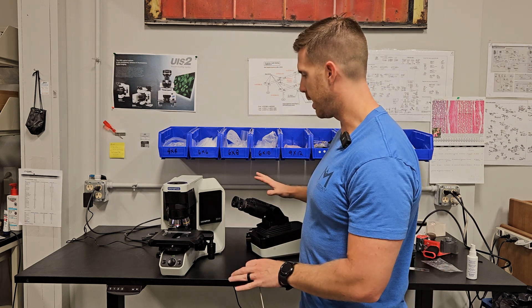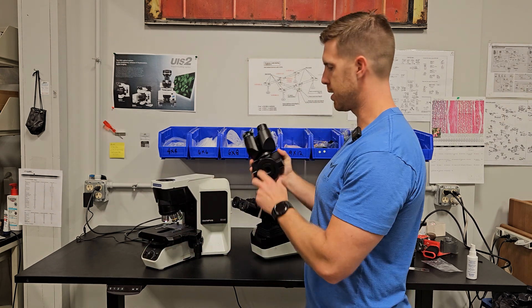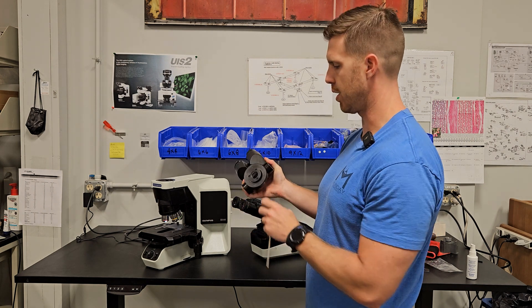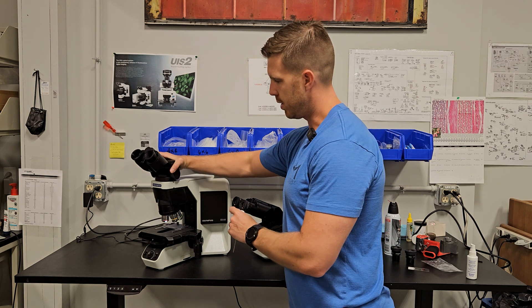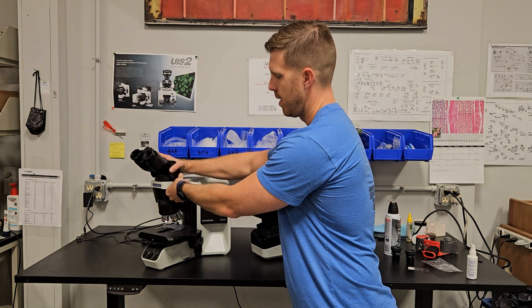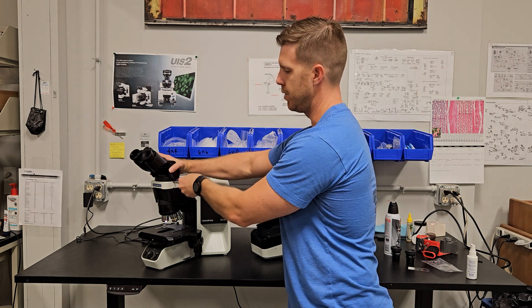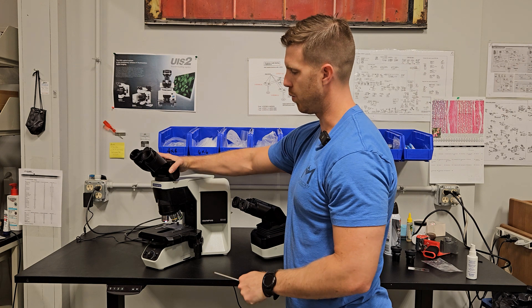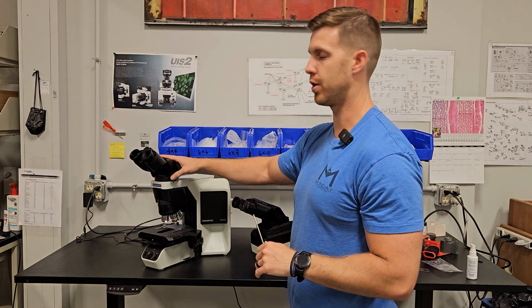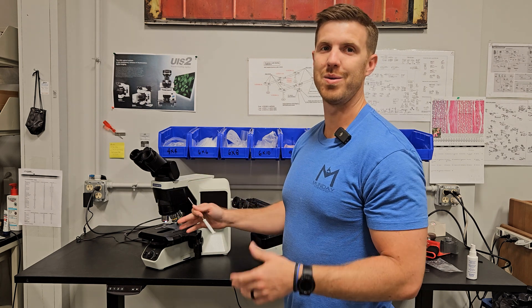Next we're going to talk about the head. I've got two heads here. This is going to be your standard tilting head — this is the most common that goes on this scope. It's going to have a flange right here. Just lock it on down. Always tighten the screw with one hand on the head in case you don't get it on the flange, and give it a little wiggle before you take your hand off to make sure it's good and secure. What you don't want is to remove your hand and have the head fall — then you're going to have a bad day.